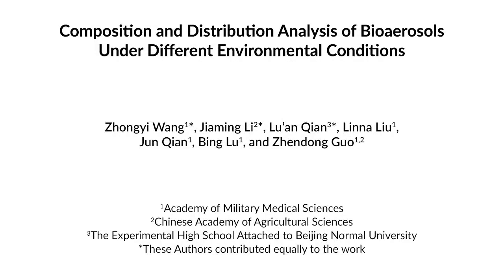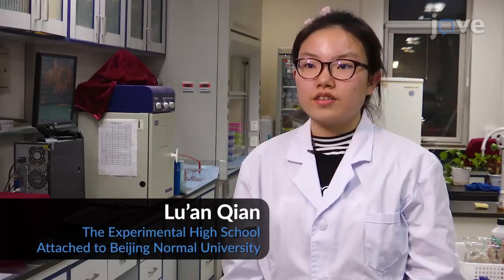Understanding the biological composition of the environmental particulate matter is important for the study of its significant impacts on human health and disease spread. These bioaerosol sampling methods and analyses may have a wide application in many fields of study, such as environmental monitoring and airborne pathogen detection.